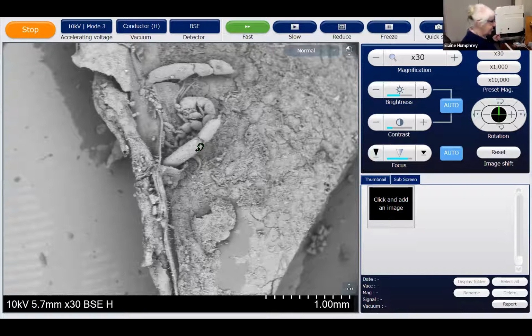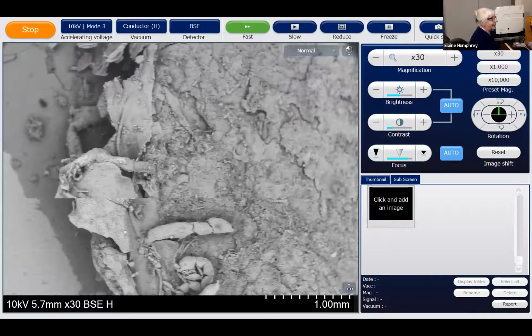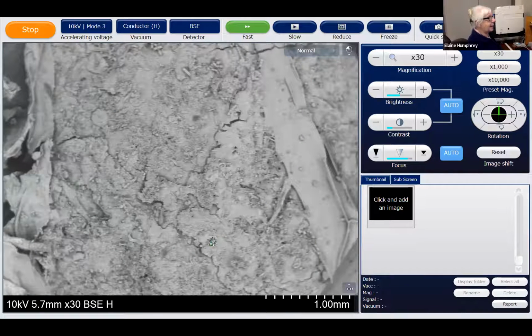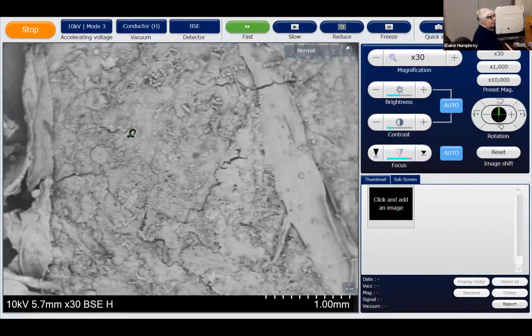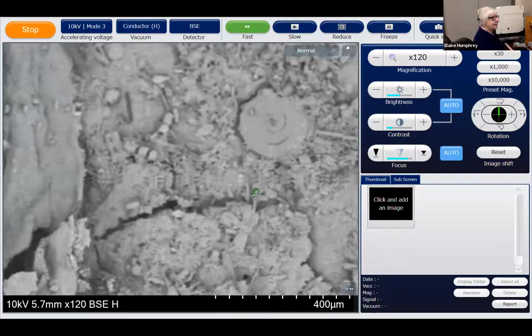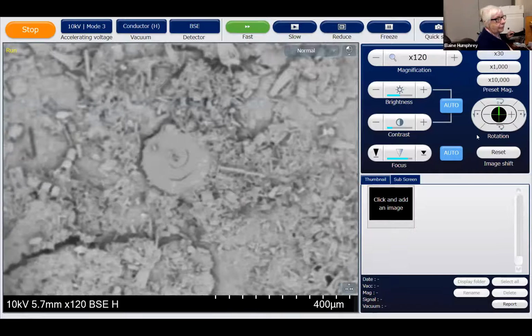Oh, we got some tintinids and stuff on there. And we got a bare patch. Right, so I'm going up here. It's because we've used this so many times. Oh, what are you? See, I got sidetracked again. I just saw something. What is it? Oh, I think it may be an annelid. No, is it? Yes, it is. Look at that. There's an annelid. Let's go autofocus.